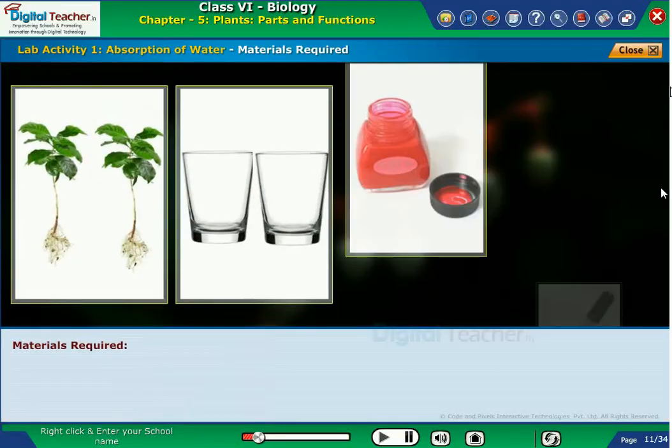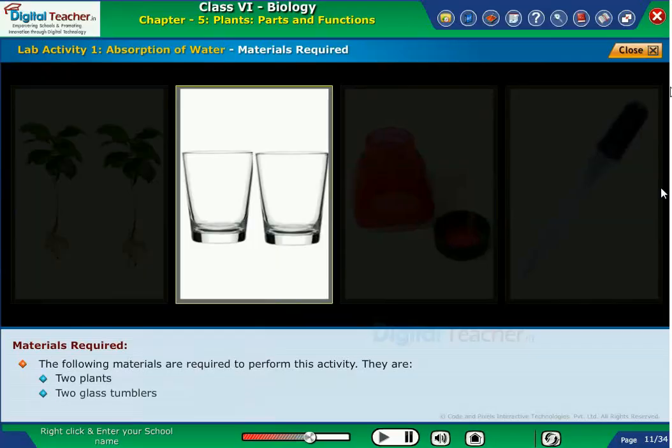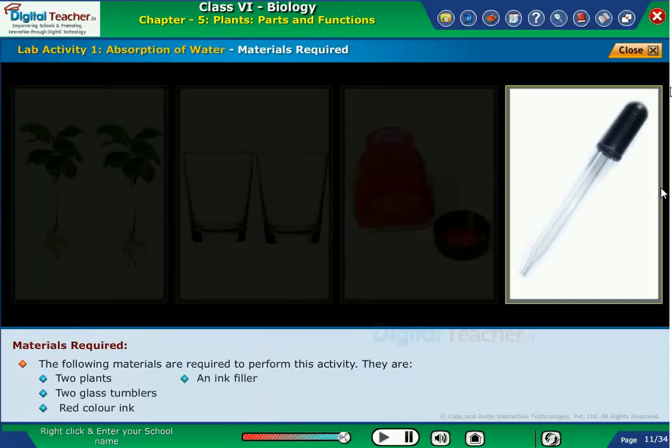The following materials are required to perform this activity. They are two plants, two glass tumblers, red color ink and an ink filler.